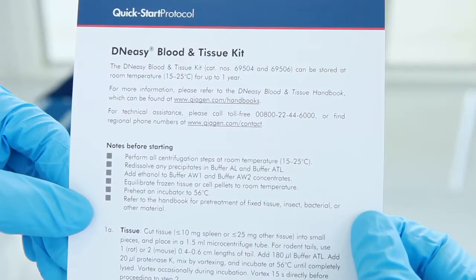Welcome to the QIAGEN DNeasy Visual Protocol. In this video, we will show you how to extract pure, high-quality DNA in just 20 minutes.